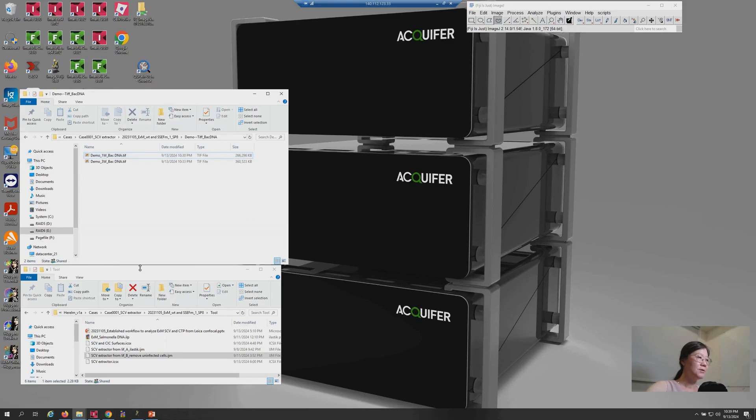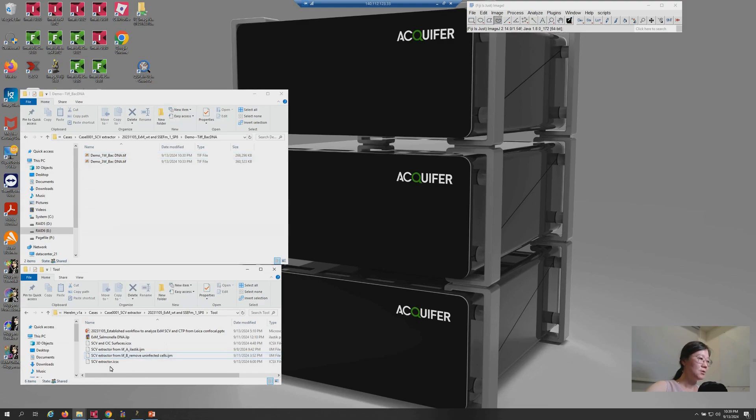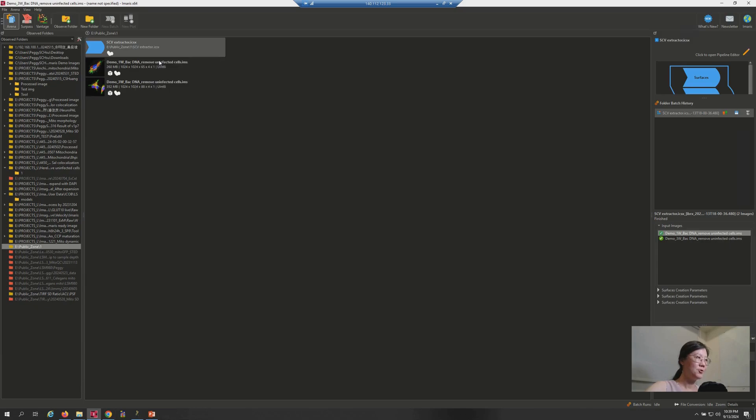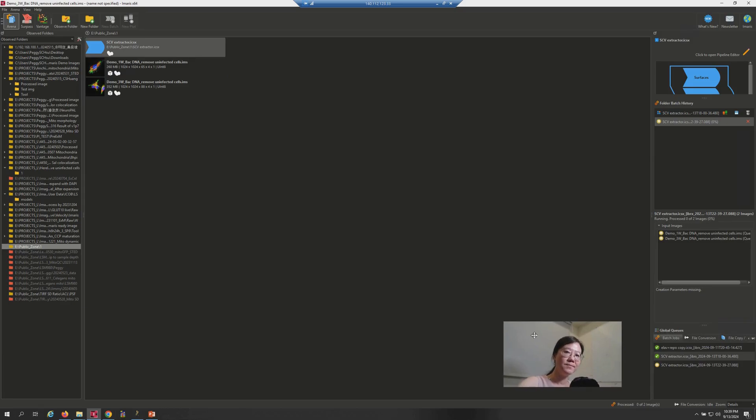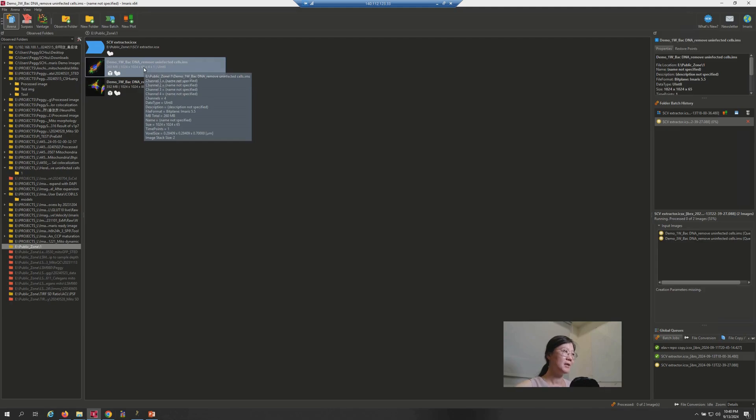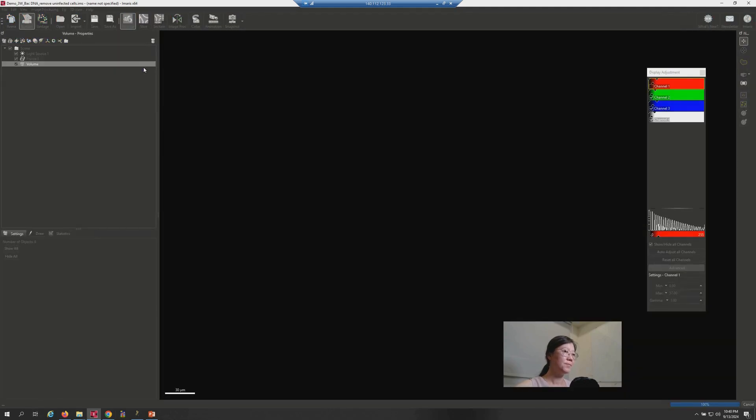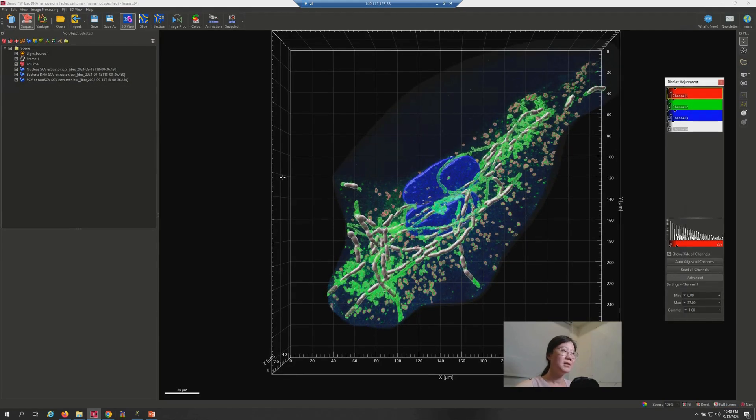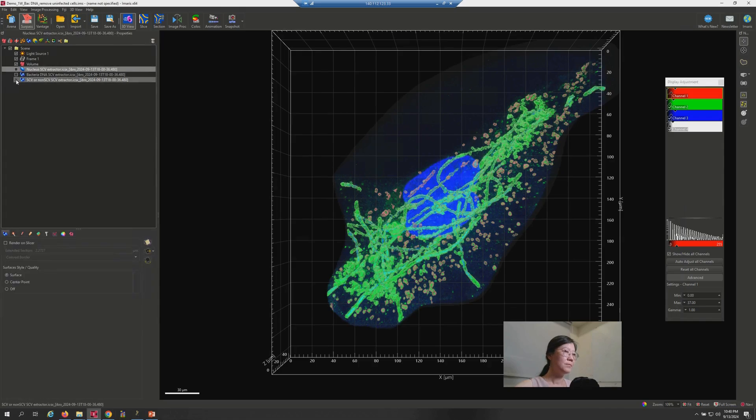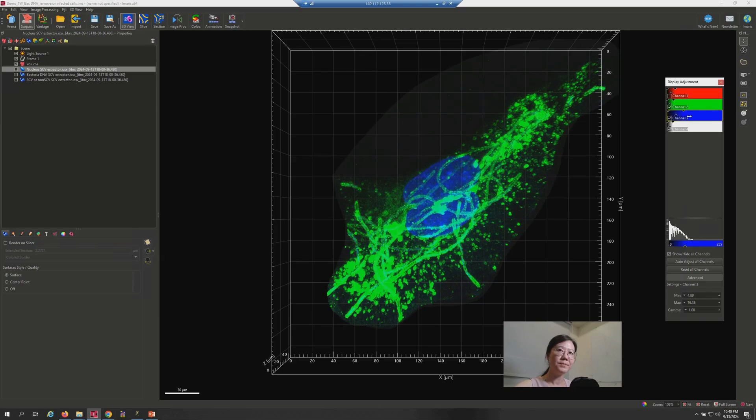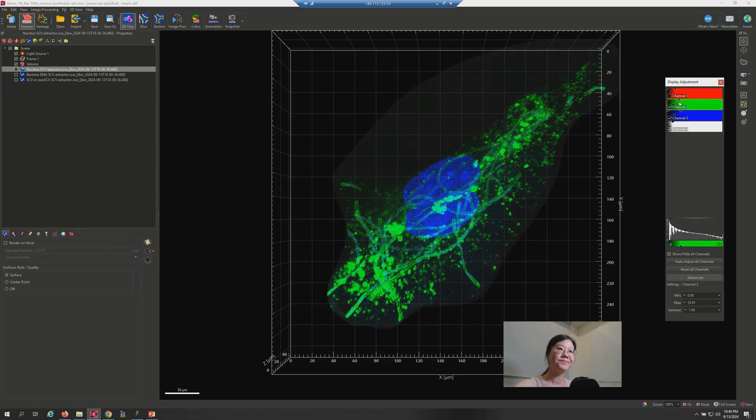So, the next step is trying to save this parameter settings for Imaris into the same folder. Then you can just launch Imaris and press run batch. And we will see here. It is turn 2. After waiting for a while, you can just check the results. So, after processing, you will see here is the original data. And let me adjust the contrast first.